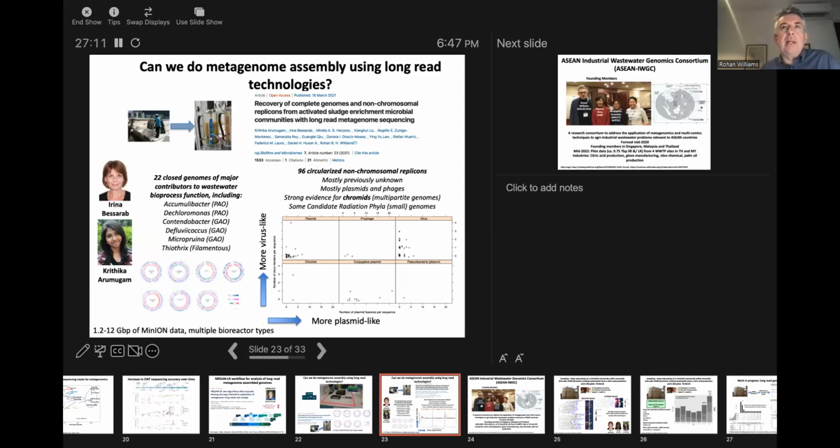And I'm going to talk about this a bit later, but we've also been able to capture non-chromosomal replicons, which are very, very difficult to reconstruct using short read data. And so we can convincingly capture plasmids and phages, but also things like chromids, which are kind of multi-part genomes. Some bacteria have multiple chromosomes, and seemingly we can capture these. And also some of these new small bacterial genomes from the candidate phyla radiation, these recently recognized novel phyla groups that have been basically captured by metagenome analysis.